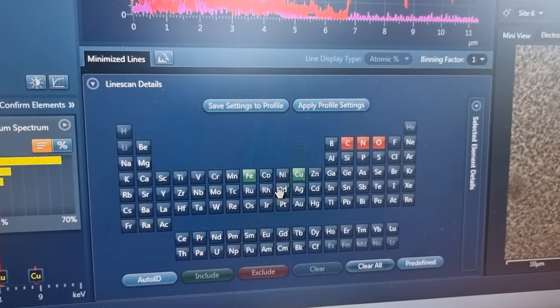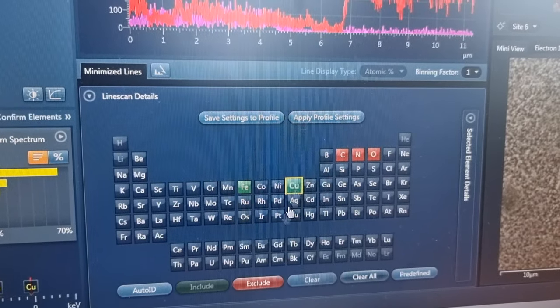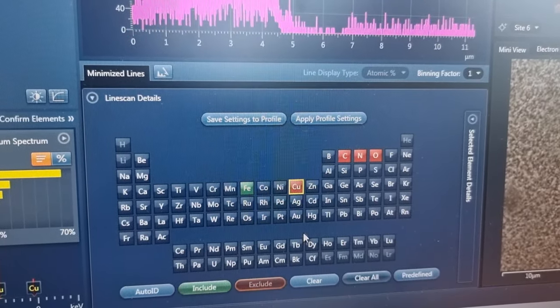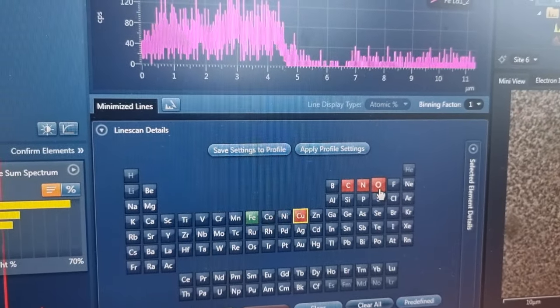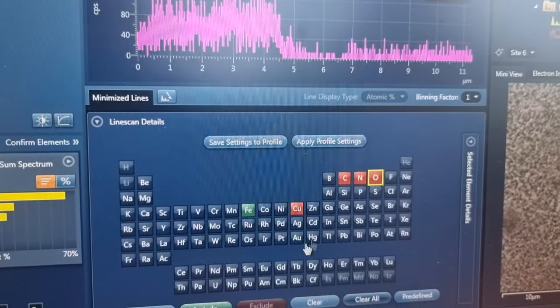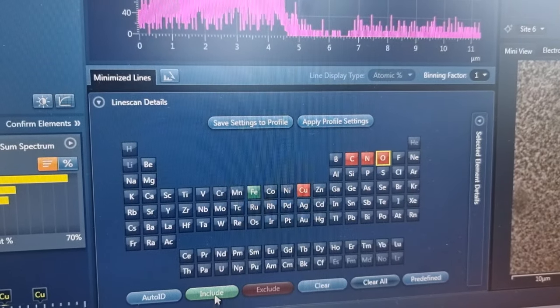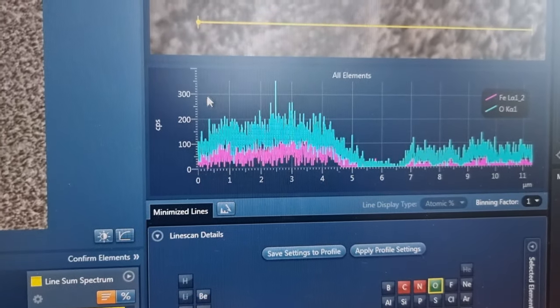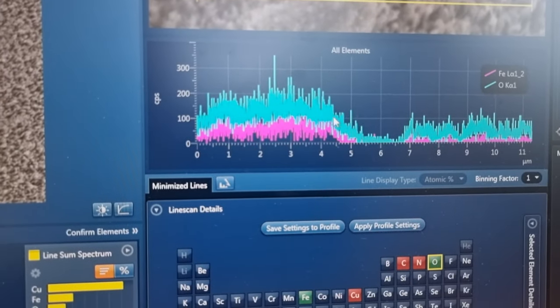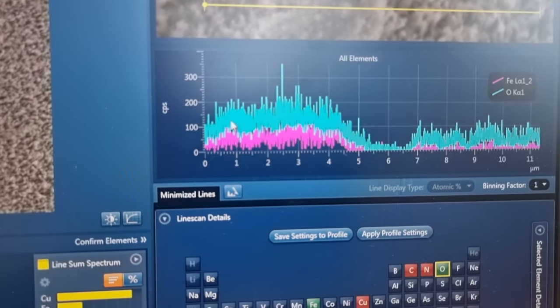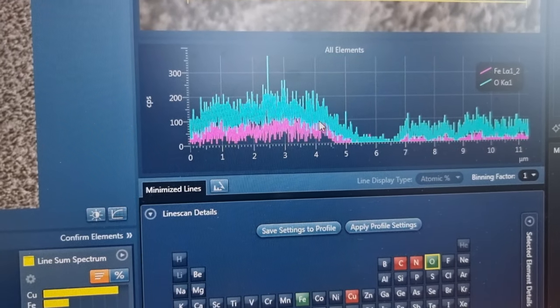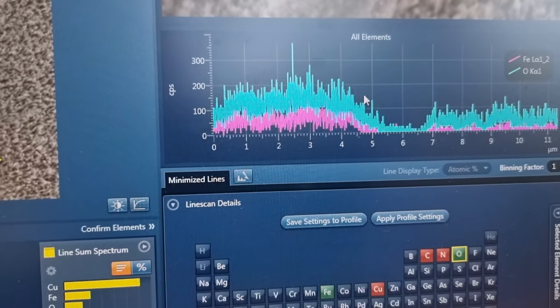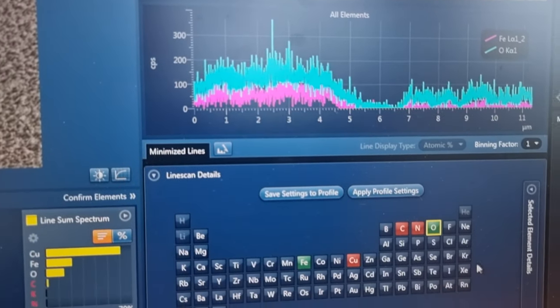So we'll exclude that and include oxygen. Okay, oxygen is following the iron. This would be maybe iron oxide of some type.